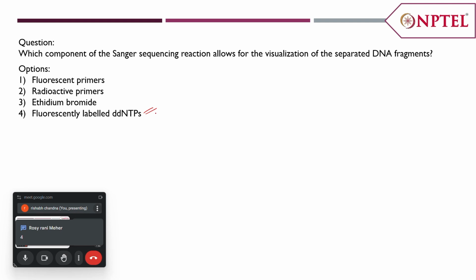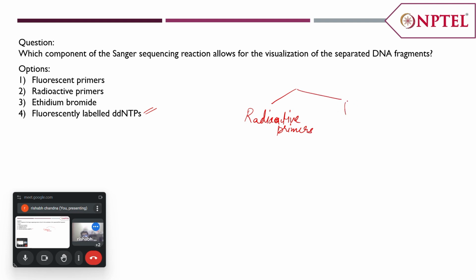Any more answers? As I have explained just now, the initial technique used radioactive primers for visualization, and the newer techniques that we are using use fluorescently labeled ddNTPs.